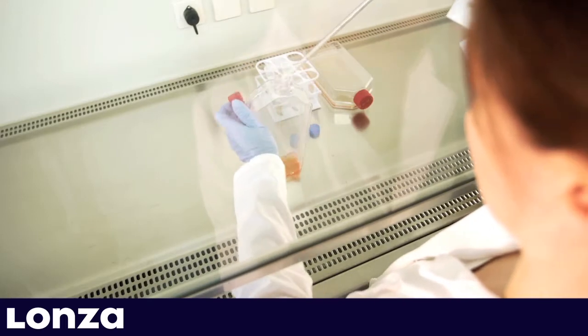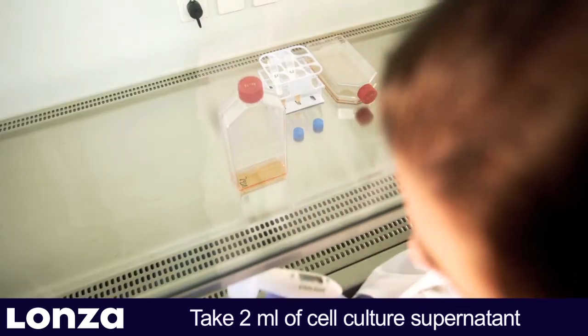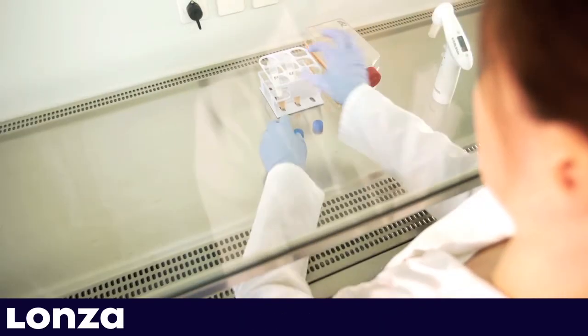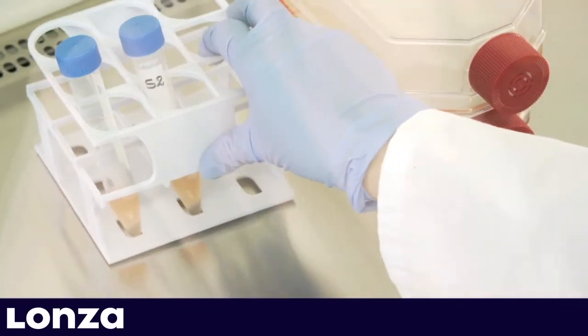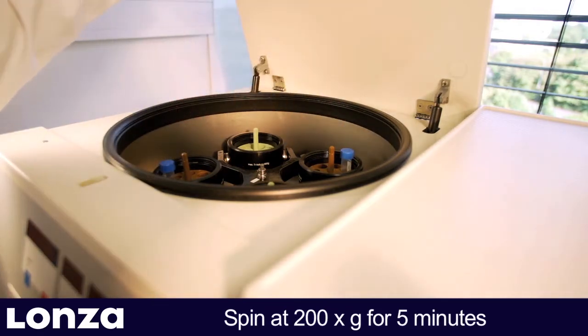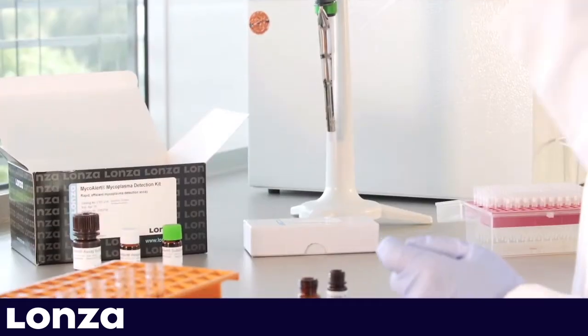Sample types suitable for MycoAlert SA are cell supernatant from suspension cells during passage or cell supernatant from adherent cells prior to trypsinization. Take at least 2 mL of cell culture supernatant and transfer it to a centrifuge tube. For optimal SA performance, supernatants should be tested as soon as possible after collection. Cell supernatants must be spun at 200g for 5 minutes to remove any remaining cells. Cells present in the sample will increase the background resulting in a loss of sensitivity.